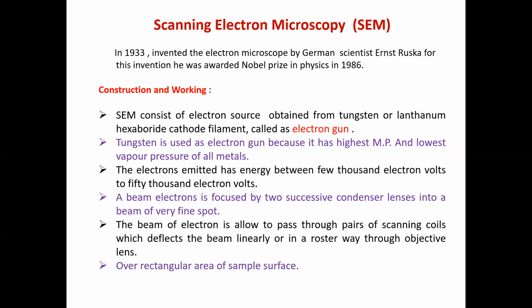So a beam of electrons is focused by two successive condenser lenses into a beam of very fine spot.